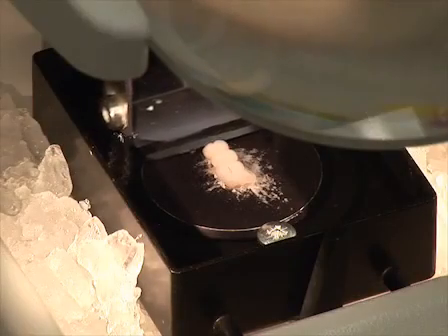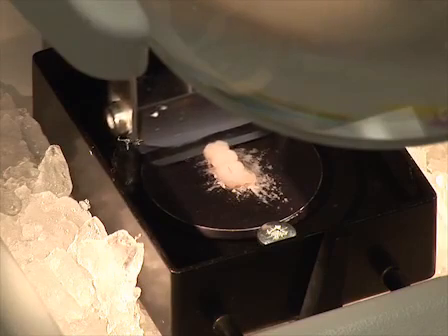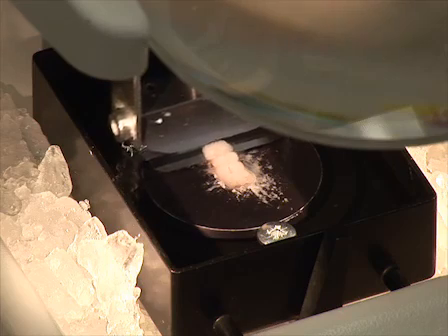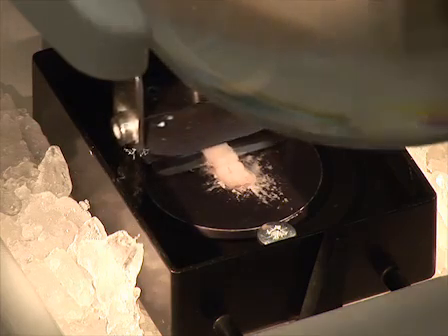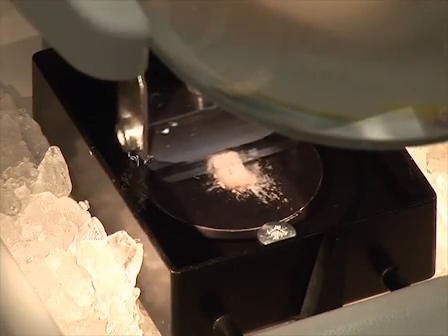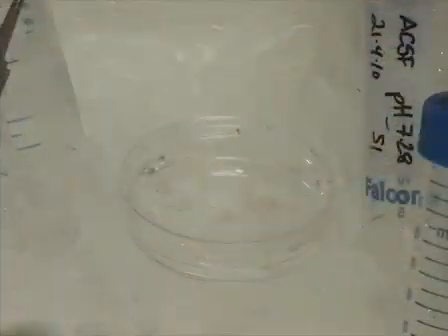Set the vibratome for a frequency of 8.5 and a speed of 3.5 to 4.5. Bring the blade into contact with the ACSF and set the automatic cut. Now we will cut 500 micron slices. Keep the slices which contain the hippocampus. Place them in a dish filled with ice-cold ACSF and discard the rest of the slices.